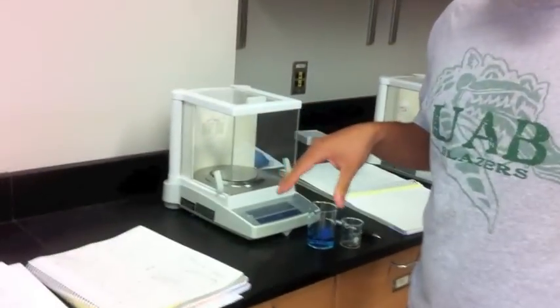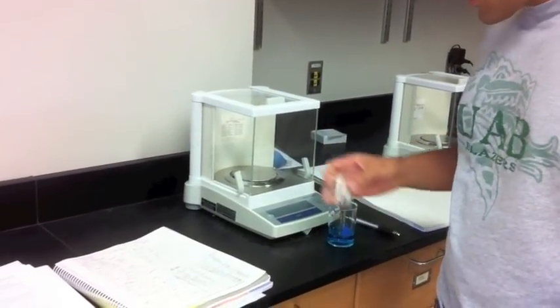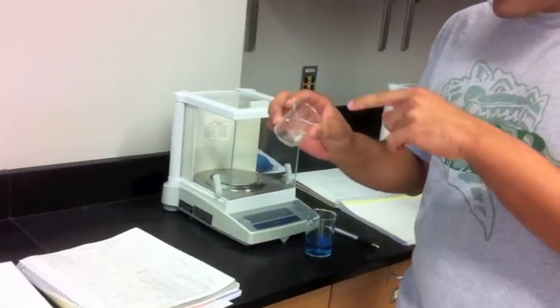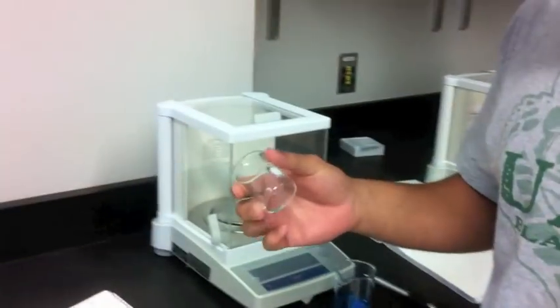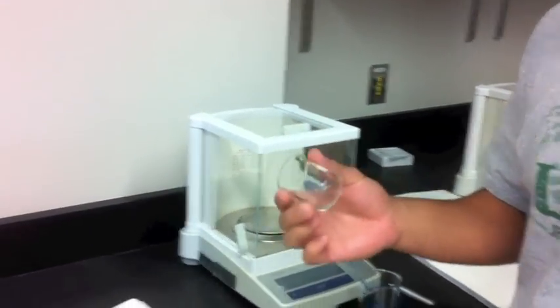There is some uncertainty with this because while you are filling this up, liquid may have been in there. So this may not be the exact mass.